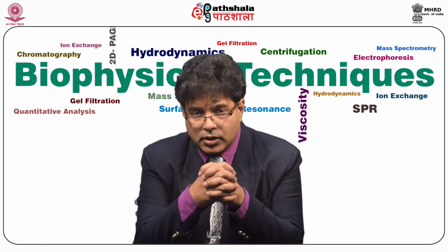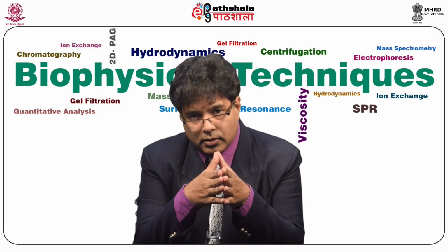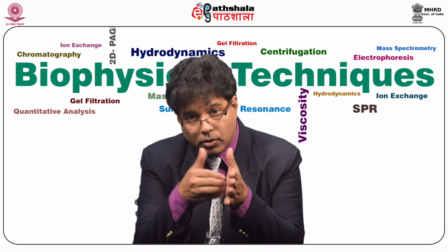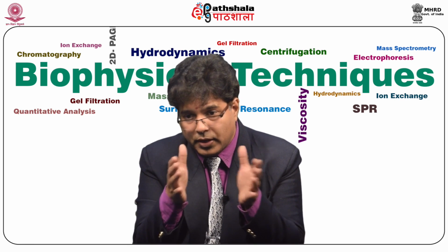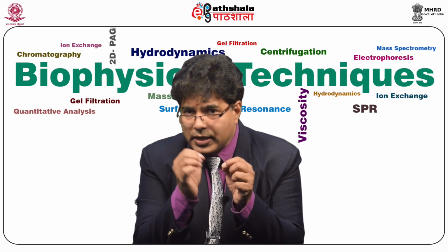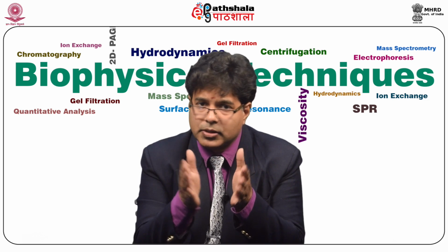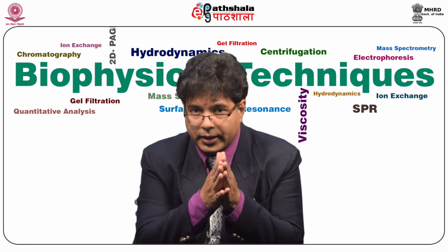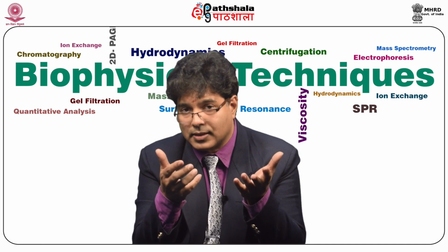If you have a lesser dynamic range, we will have a cap on the analytical capability. This determines the accuracy and precision of the analytical method. As we know, these analytical methods often go through rigorous quality control measures according to guidelines. For example, pharmaceutically, when drugs are analyzed, they use criteria such as the US FDA criteria and ICH GCP criteria. These stringent guidelines are made for each and every aspect of analyte extraction, isolation, and analysis, dynamic range, and each and every parameter, their reproducibility, their recovery, everything is meticulously calculated. Even if two analytes are co-eluting, one should not affect the response of the other. We will deal with these aspects when we come to the analysis, and at that time I will explain it to you.